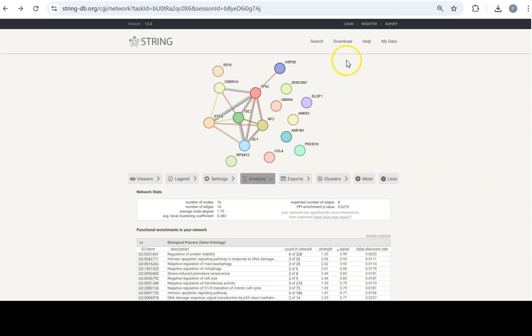So again, this is a fantastic resource, I think, both for making images and to identify pathways that are enriched. And I think it's an important point to make. Again, when you have a lot of genes, it's going to be harder to see this. But what you typically want to see is networks, that genes are interacting. There are certain interactions between genes. This doesn't mean that a gene is not real or not important in your screen setting, but I would definitely suggest that you start focusing on the enriched genes, or the genes that are connected, when you try to understand your hits in your screen.